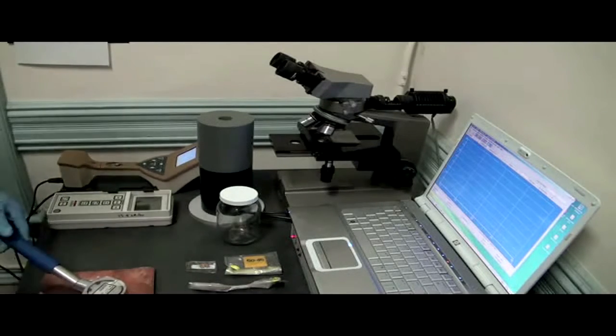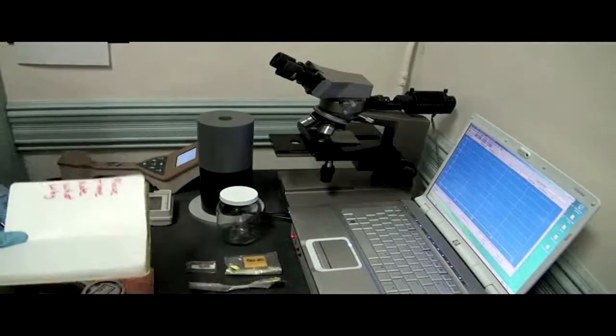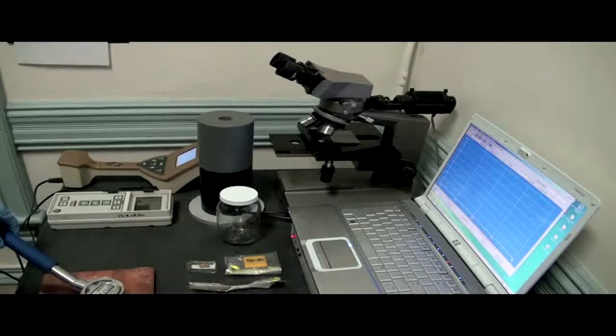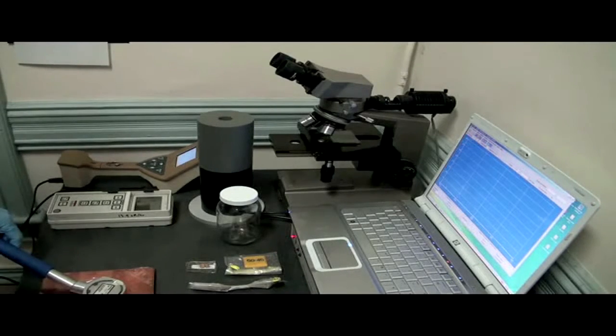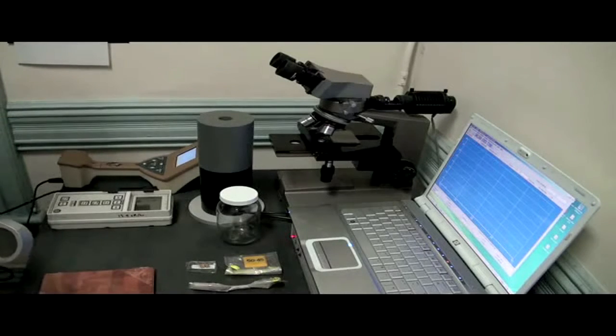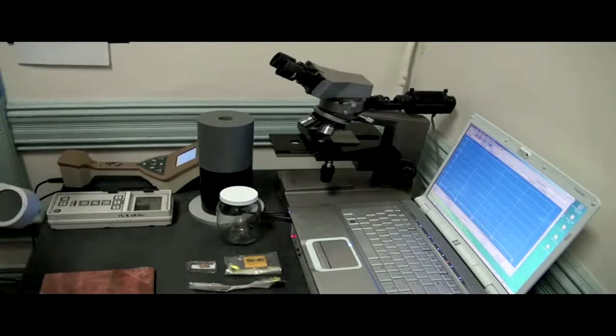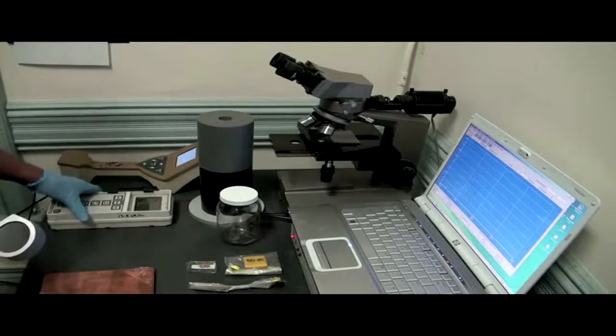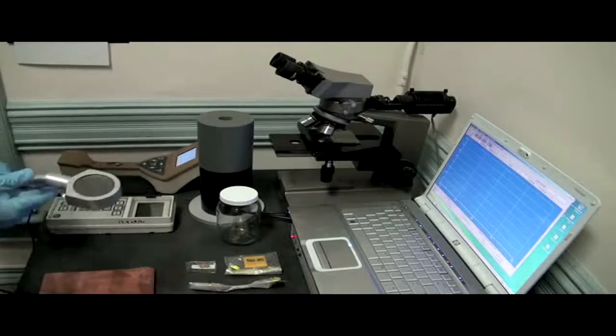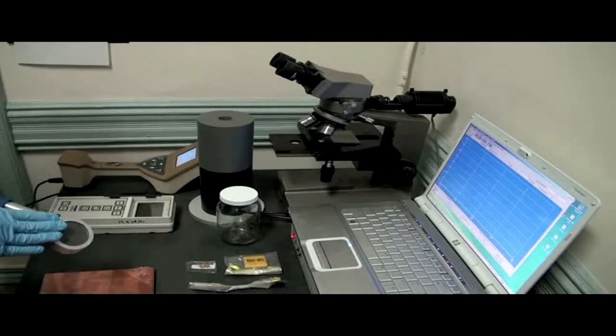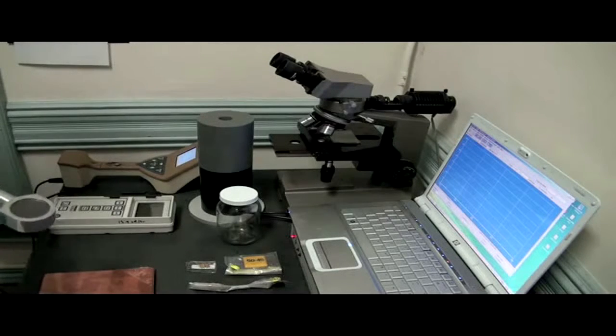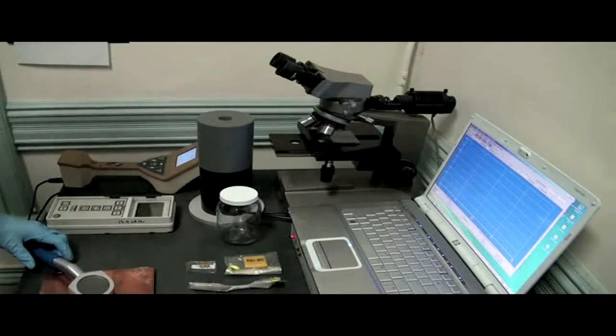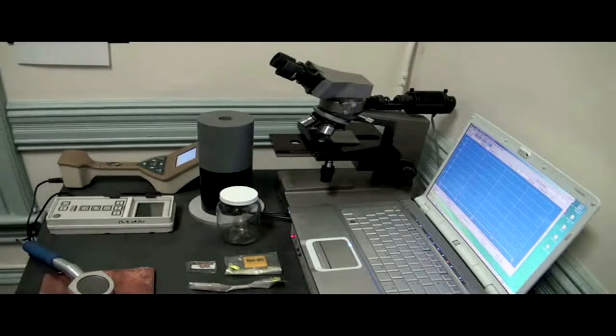Actually, if you remember, our first set of three measurements, so we're going to write them all down and that's when there's no sample at all and we've got our background number. And then we want to take a sample and we want to see if it's different. So I have a few things here that we can take a look at and we can see whether or not there's a serious difference. So I have a basic Geiger counter with a probe that's sensitive to alpha, beta, and gamma radiation. And let's turn on the audio. So now we're hearing background. This is what's happening when there's no sample on the probe.